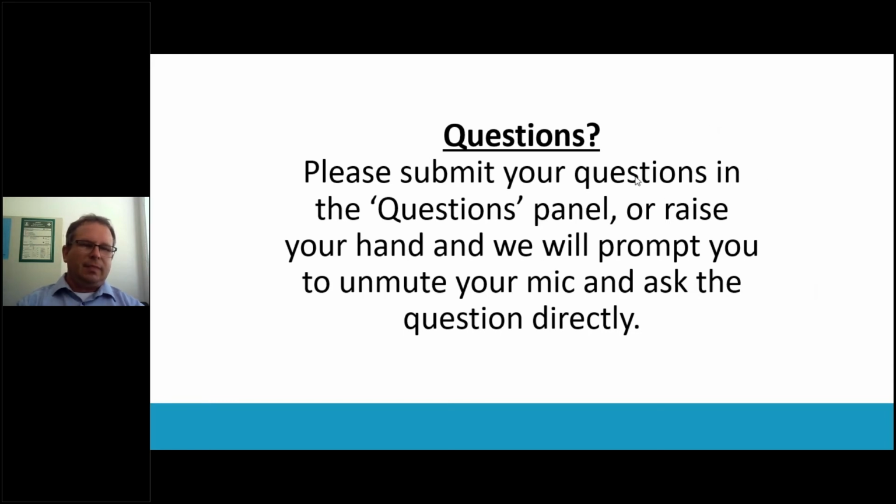Well, I would say it's a very useful technique. As I mentioned on my slides, of course, the final goal would be to be really able to calculate also the values of the contact angle that you could directly insert into modeling and which you could directly use to feed your models. That is not feasible with the values of the surface energy and its distribution as I showed today.